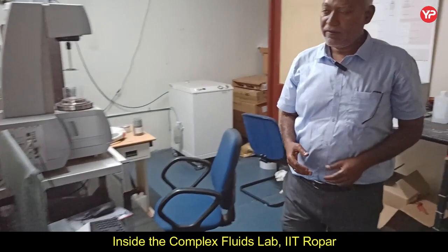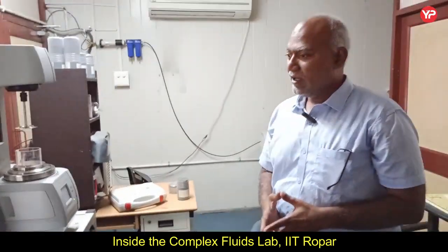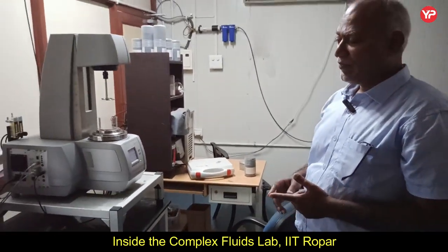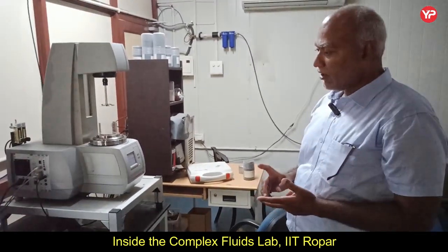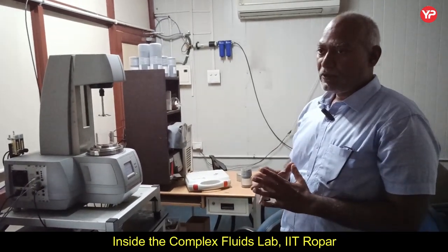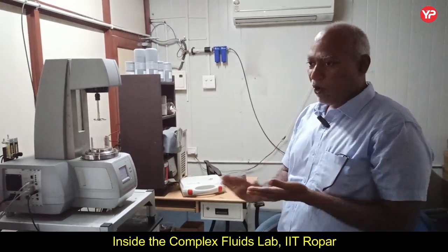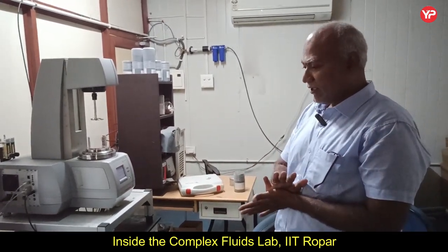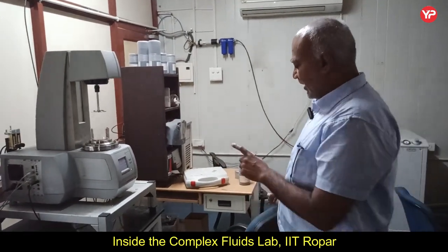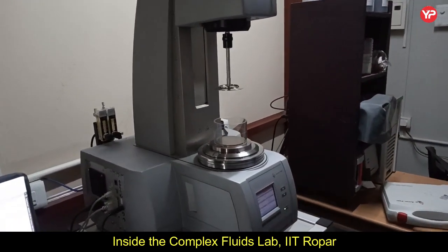So here we have our rheometer. This is a departmental research facility, and this rheometer is used to study the viscosity or the rheology of all complex fluids, whether it's a gel, whether it's an oil, all kinds of fluids basically. Right now it is fitted with the interfacial rheology module.